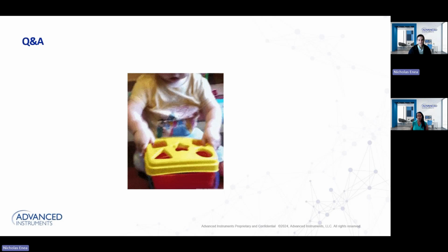Yeah, beautiful. And I can give you an example of that, not even just in the pipetting world. A couple years ago, I was at a customer site. They decided on tolerances before they actually checked them. They put very tight tolerances in their SOPs at 1 microliter: a 5% inaccuracy and a 5% imprecision that they can never hit. They just arbitrarily chose that tolerance based on the liquid handling manufacturer. So it's very important to really understand the data, whether it be Artel or another product, hopefully it's Artel, and have data-driven tolerances before you put them into your SOPs.